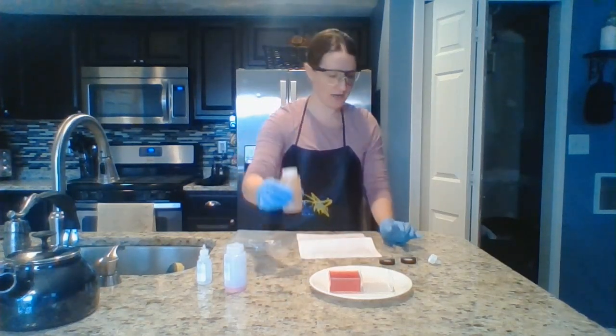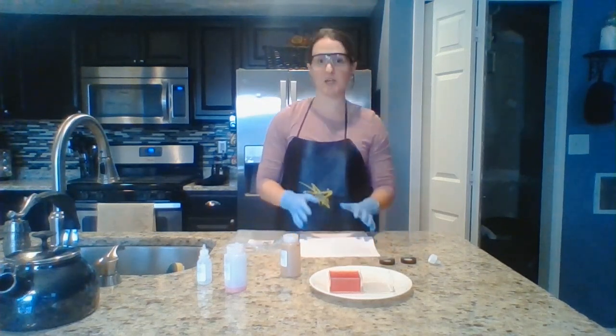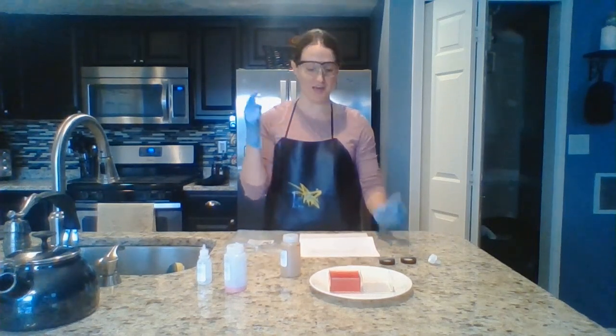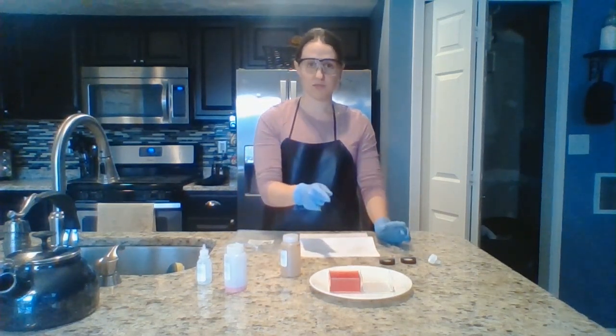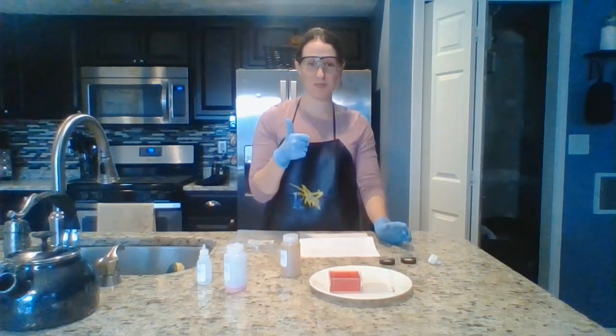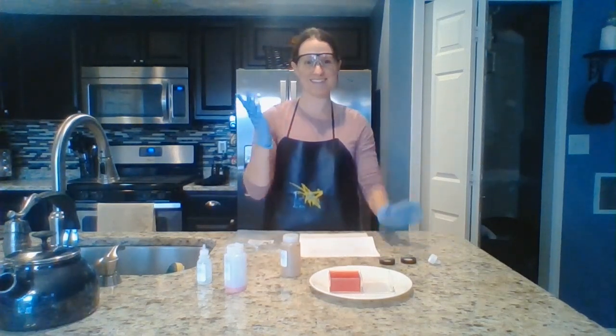I'll go ahead and do the same with the second bottle, but you can go one at a time. And once that agar is set, we'll come back here for part 1 and 2 of our actual lab. So we'll put that aside, take a 12 to 24 hour break, and I'll see you guys back here in a little bit.